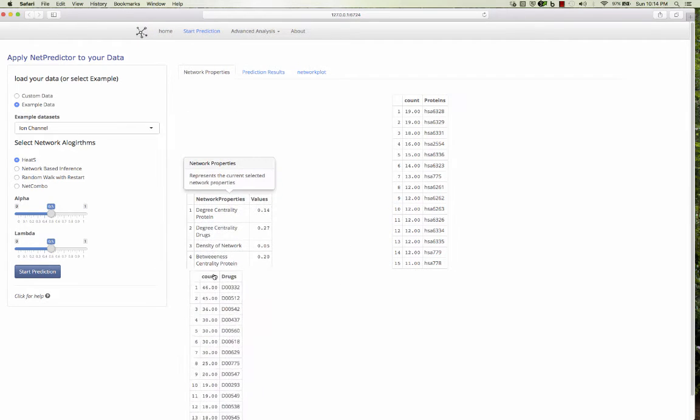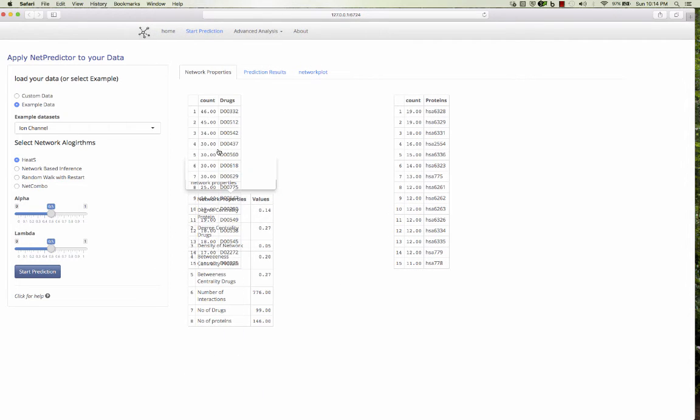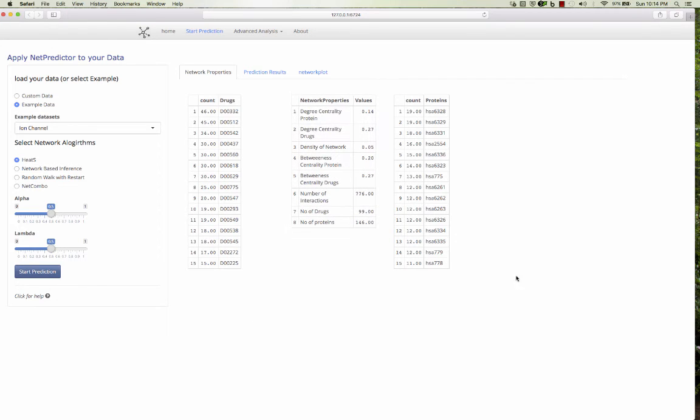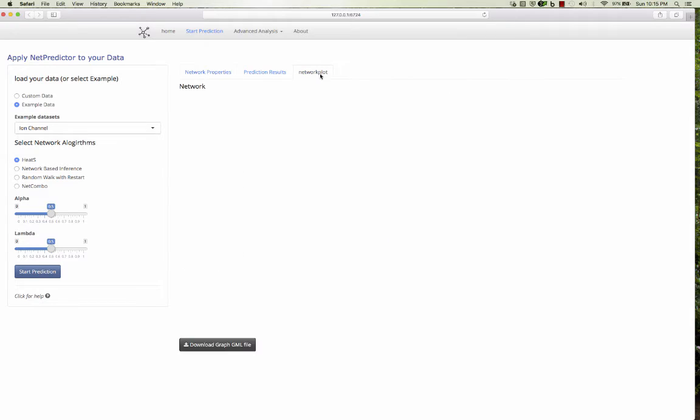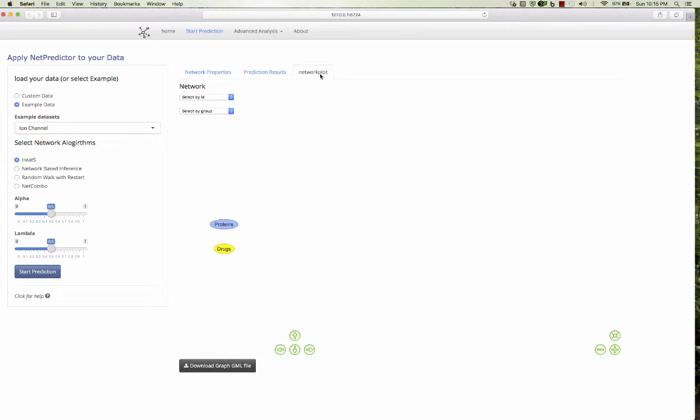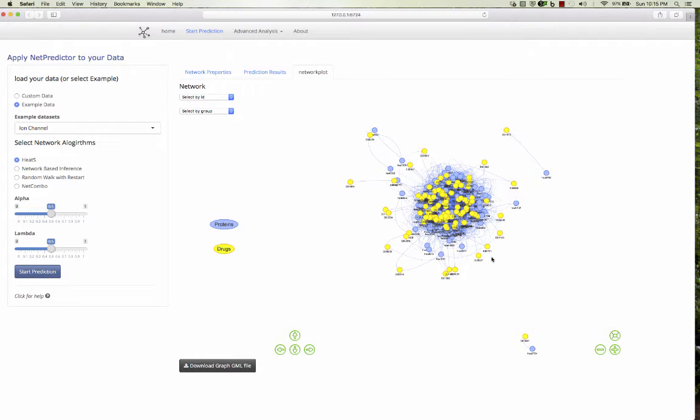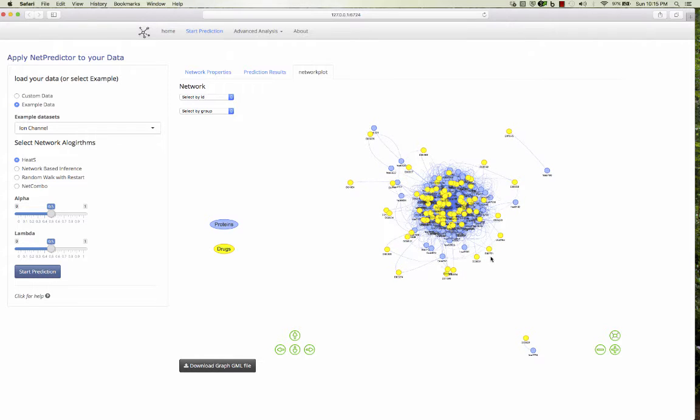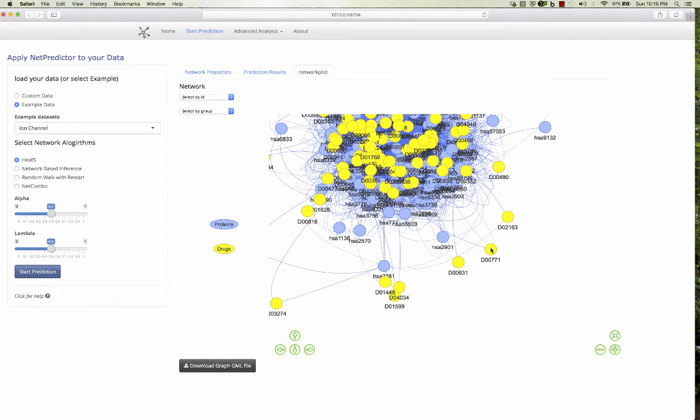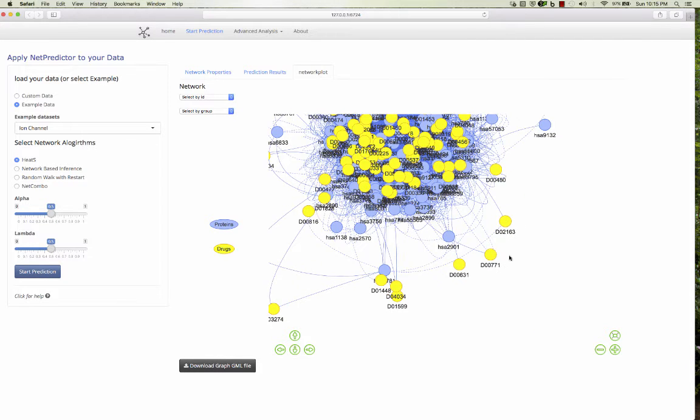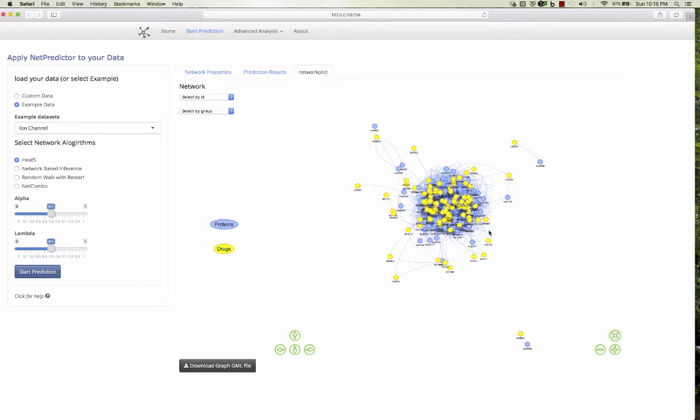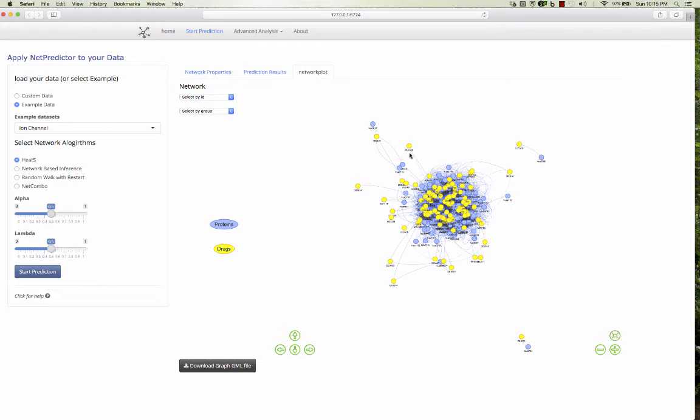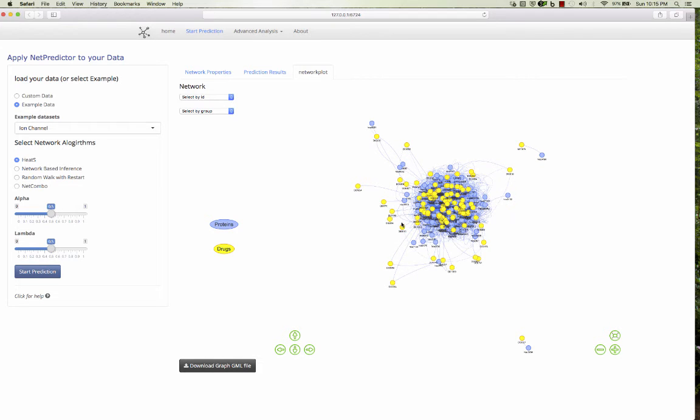And if you want to put it somewhere, you can do it here and there. There's also a network plot of the predicted relations. This is based on the vis.js library and it shows up with the network. The dash lines you can see are the predicted interactions.